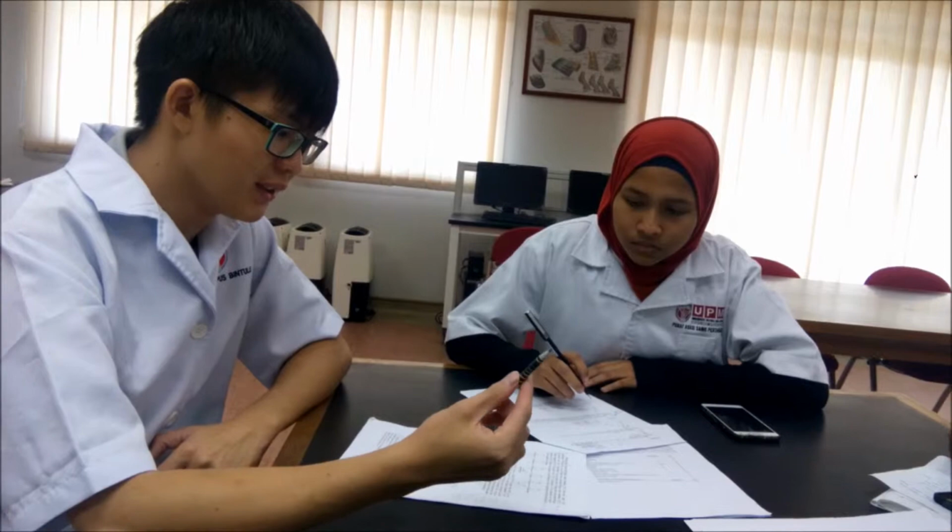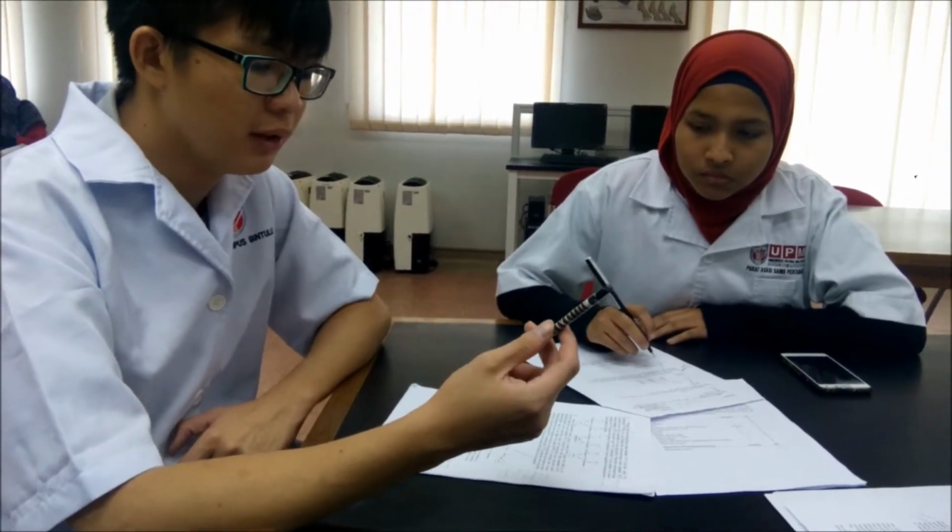Then we will set a stopwatch like this, and we will pipette the 250 microliters of enzyme from the tube labeled 0 degrees Celsius enzyme into the tube labeled 0 degrees Celsius substrate, and then place it back into the ice. The same step is repeated for the rest of the tubes, and the stopwatch is started.